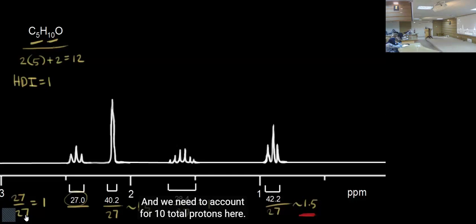Because in the proton NMR spectrum of a small molecule, most often there are some one-proton signals, because specifically we're talking about natural products. So they have stereo centers. Most of the natural products that we are all working with have some chiral centers, more than one chiral center.